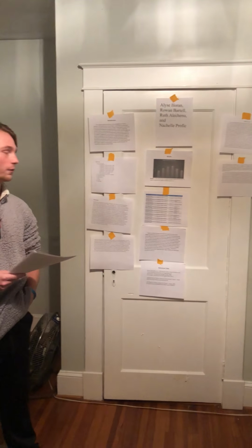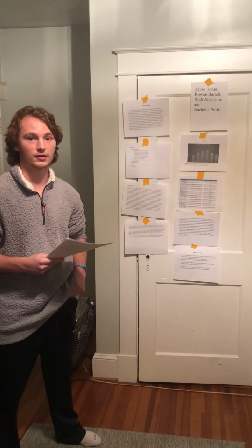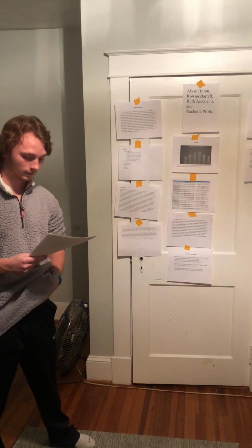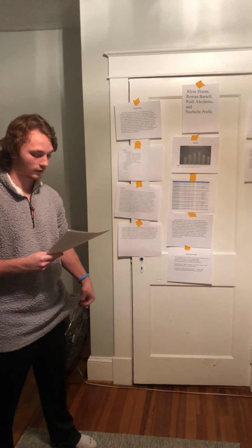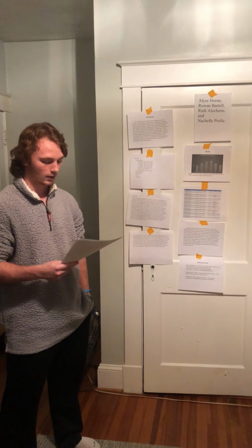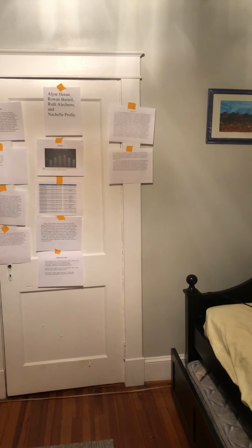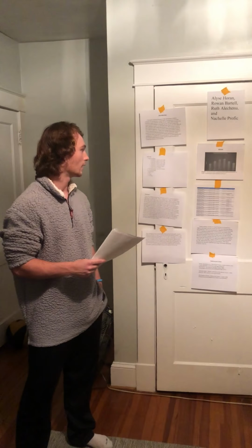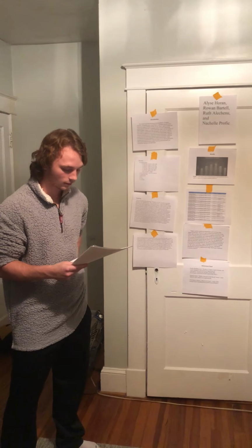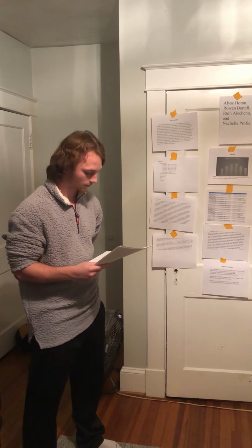Our original hypothesis was not fully supported, as our data showed that activity would increase and then decrease, and we had only thought that the trypsin activity would decrease originally. Our next hypothesis was fully supported, as our results showed that it would increase and then denature after a pH of 10. Our experiment was fully adequate to test our hypothesis.